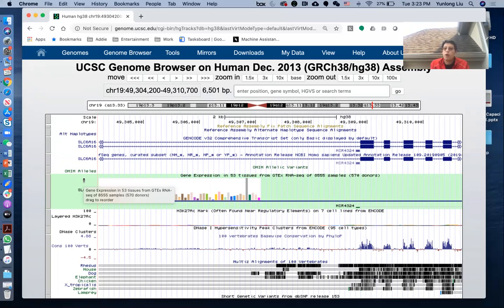Before we load our data into the Genome Browser, we have already processed the data and generated a BAM file and another file format called the bigWig file. That is a binary format that is very large. It's indexed, and it tells you where the biological signals are. So I will show you how to put these files into the Genome Browser to visualize them.